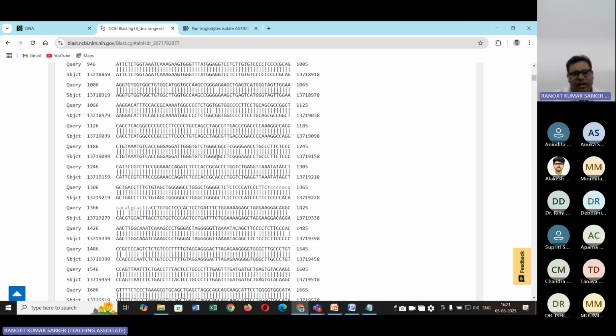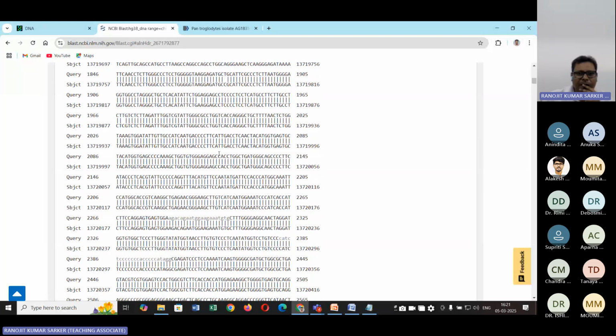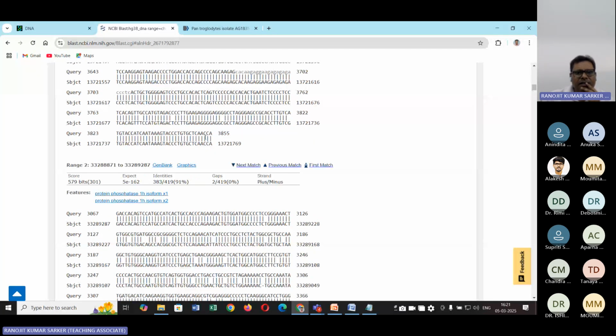So you can generate this alignment, and it can be applied into different software, and publication quality pictures can be generated by using different tools. Okay, so these are the total alignments, and this is all. Okay, so now you can report your sequences and the other statistics that have been asked. Okay, so many times your reviewer might ask some queries and you can solve them in this way.